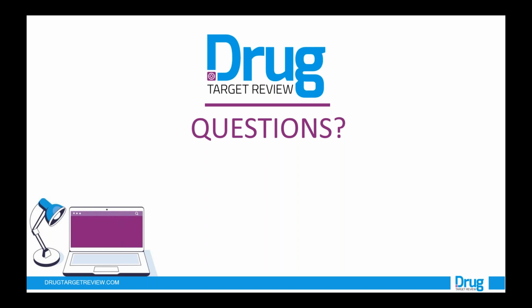Thanks, Paul. So another question for you now. What is your experience of potency and efficacy readouts of your compounds in the InCELL Pulse assay in comparison to in vitro target engagement and potency in cellular activity assays? And do you use them quantitatively or qualitatively? I'll comment on this, and then I think Lester might be able to add to it. First of all, when we use this assay, we are getting information about the affinity for the target in a cellular context, and also the permeability.